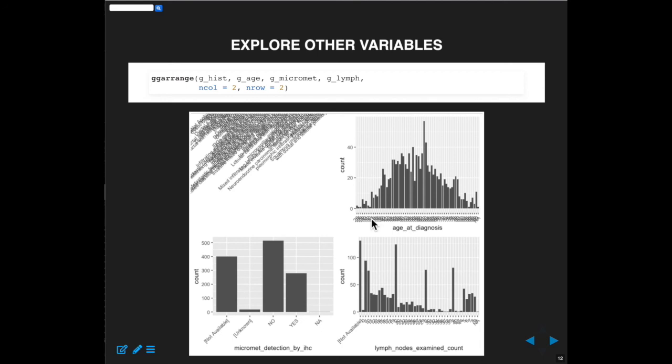Age also, in principle, has many different values, but here in TCGA, this was just the year, not the number of days since birth. It was just an integer, like 61 years of age or 75. And I could have been a little bit fancier. They're squished together here. If my screen was bigger, I could widen it. But you can see at least that there's a good amount of variability in the age of the patients. Okay, this is NA down here. You can't see it too well. But we do see clearly a lot of variability. Recall there's 1,200 patients in total, and only this one here is like 58 or so patients. So it's really quite a nice broad distribution.